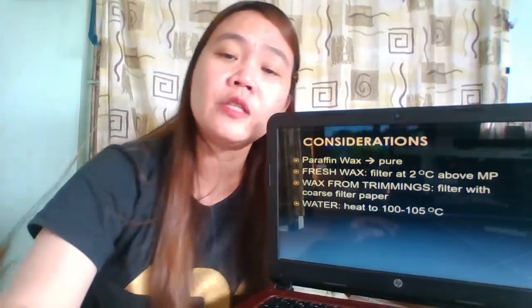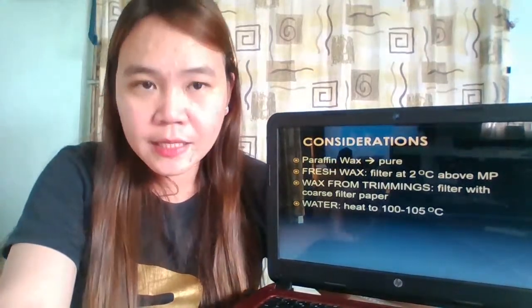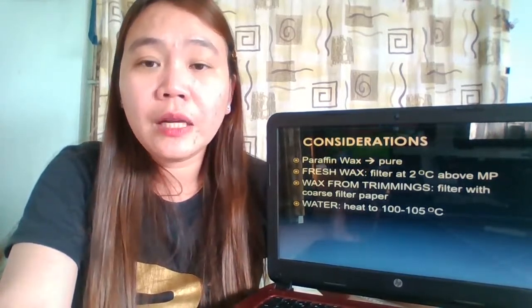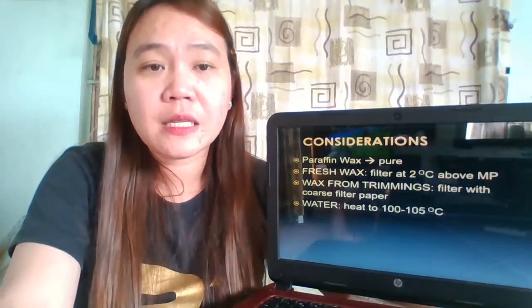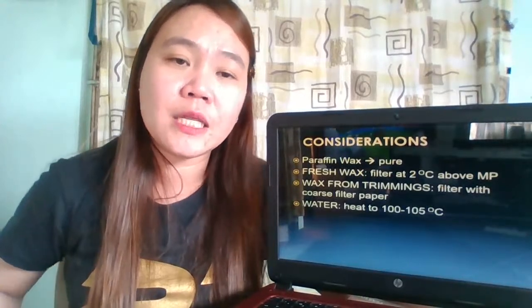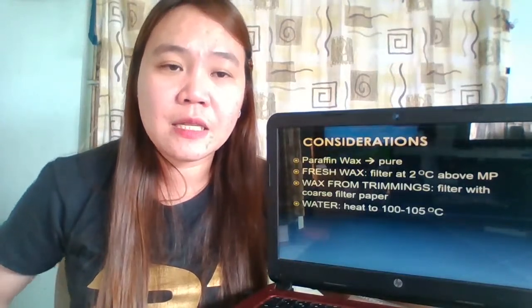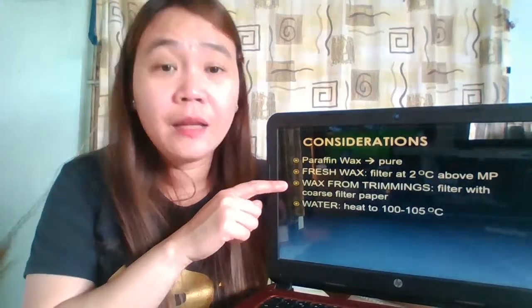Okay, that is pure. So how do we do that? If you are using fresh wax, you need to filter your fresh paraffin wax at 2 degrees Celsius above the melting point of your wax. I repeat, for fresh wax, you have to filter it at 2 degrees Celsius above the melting point of your wax.